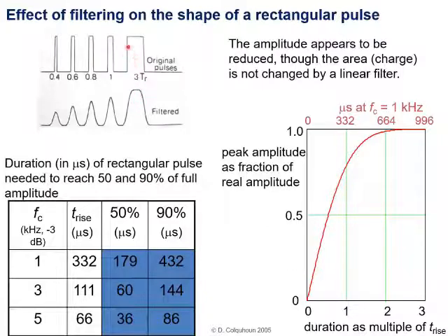So you can see that with a long pulse, we have the equivalent of that oocyte neuronal nicotinic, and we have a detectable top here that we can measure with a double ruler. But shorter pulses that are, say, 1 times the rise time of the filter, and you will find a table below here that tells you what that is, they become smaller and smaller.